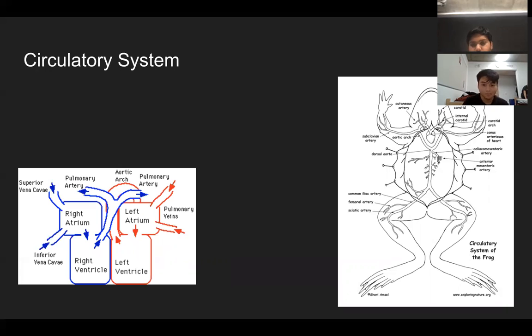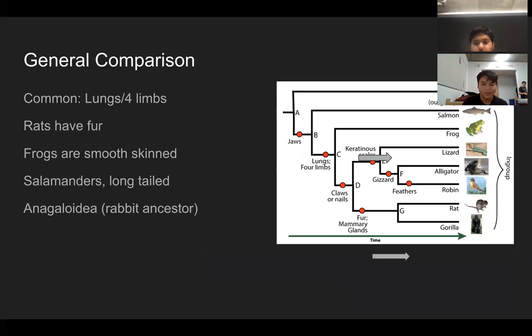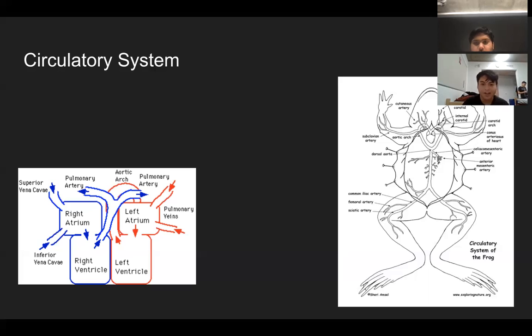And the parts of the heart are the superior vena cava, right atrium, inferior vena cava, right ventricle, left atrium, pulmonary veins, pulmonary artery, and aorta. Yeah, that's pretty much it. Also the blood vessels, arteries, capillaries, and veins, transfer plasma, red blood cells, white blood cells, and platelets. Yeah, that's pretty much it.